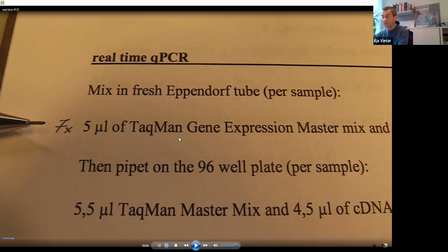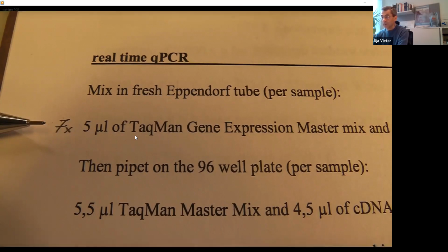So one of them is using SYBR Green. What we are using here is the so-called TaqMan probe. So the system, you have to understand how it works. It's important for the whole experiment, and that can be part of your protocol. The advantage of this system is that whatever you want to detect, any new gene, you always use the same algorithm. So it's always the same temperature, timing, and everything in the PCR reaction.